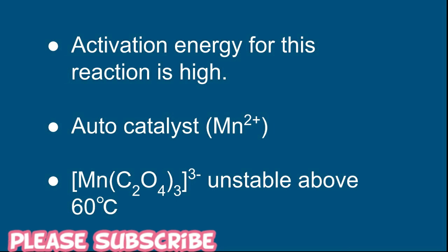Why should the temperature not fall below 60 degrees centigrade? Because during the reaction there is a formation of a complex which is reddish brown in color and unstable above 60 degrees centigrade. If the temperature falls below 60 degrees centigrade, then we will observe the complex and be misled into thinking that the end point of the reaction has come.